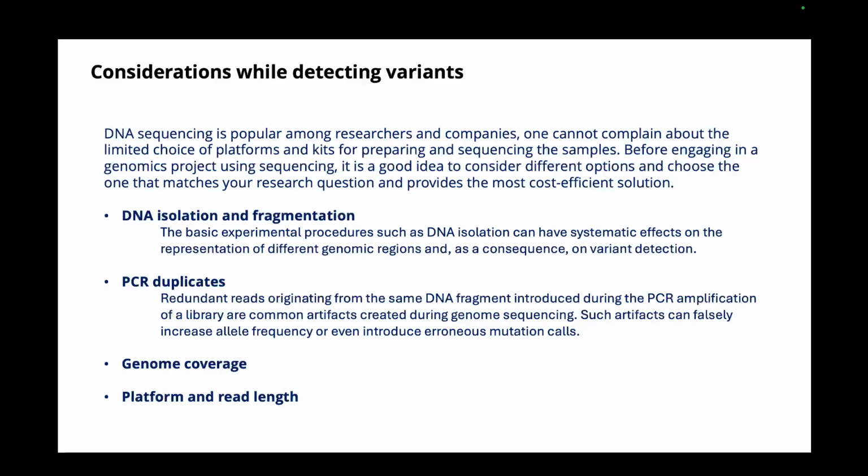So what happens is, if you do not remove the PCR duplicates from your reads and you align those reads directly to the reference, it can be possible that if one of your reads has been detected in a wrong manner or there has been a sequencing error in one particular read, it is highly likely that that particular sequencing error will be amplified in the next reads as well. So if you do not remove the duplicates, you'll have the same read present multiple times.